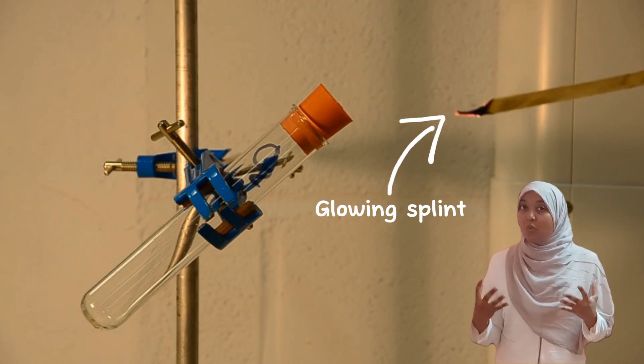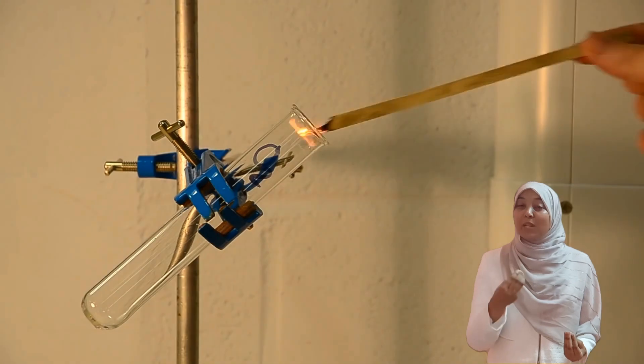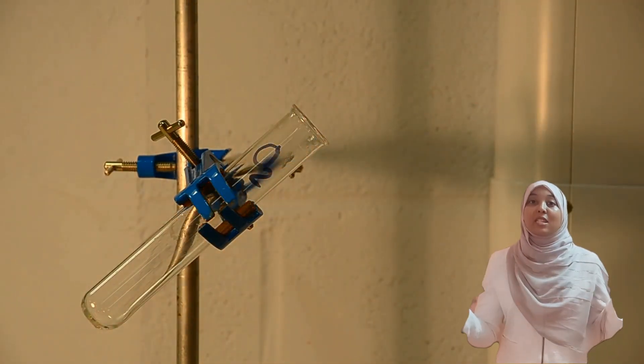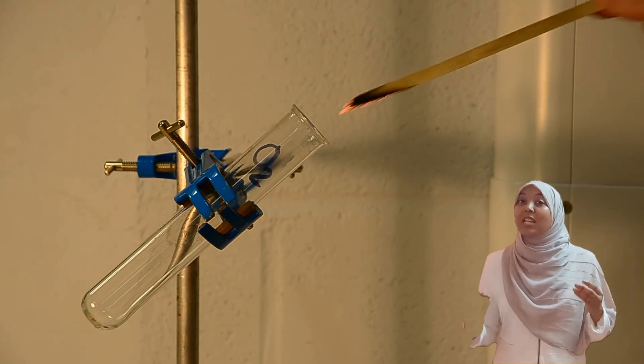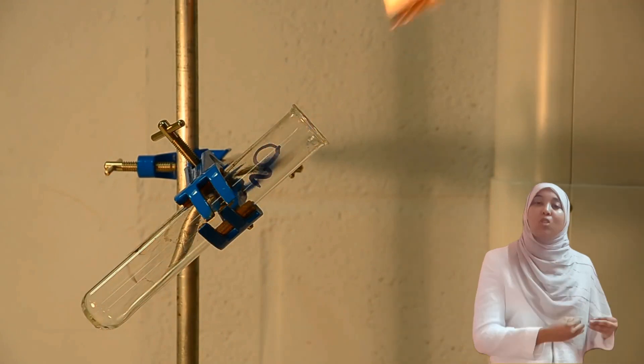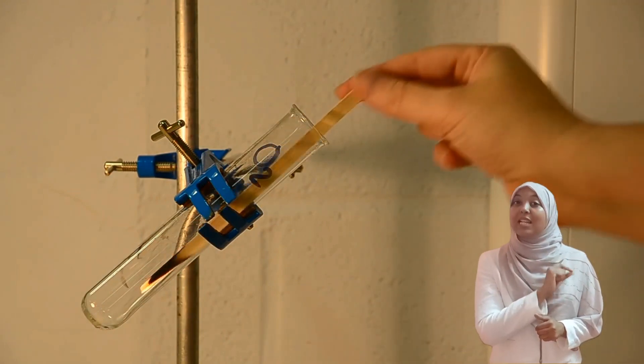Now, when you introduce a glowing splint in a container having oxygen, it's going to relight. So that is the test for oxygen. Remember, oxygen supports combustion, so when it relights, that means that oxygen gas is present. So the test for oxygen gas is that it relights a glowing splint, and that is the procedure you need to follow.